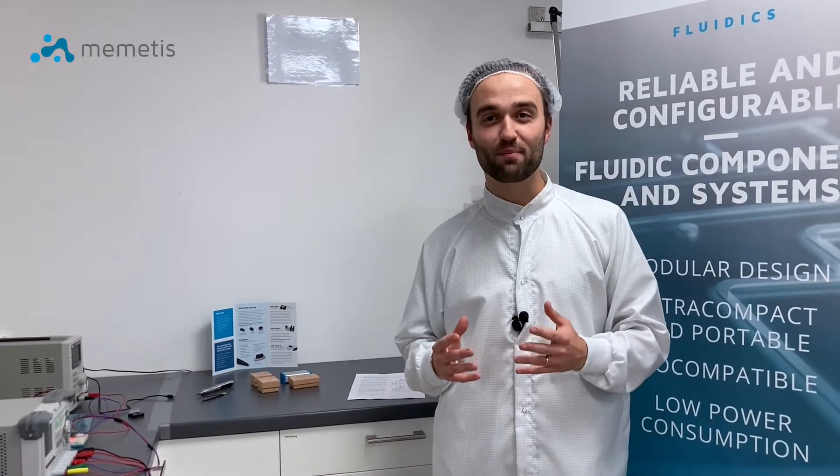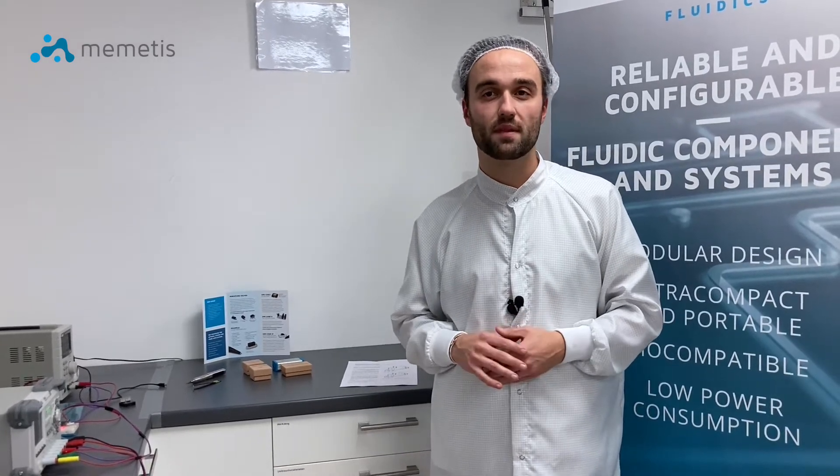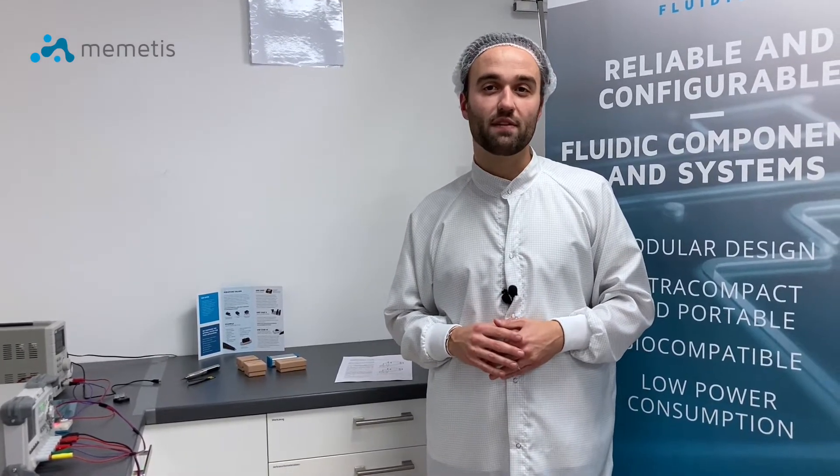Here at Memetis we develop miniature valves that enable smaller devices, for example in the areas of diagnostics or analytics for cell cultures and many others. In addition to saving weight and installation space, our valves are characterized by silent switching, a small internal volume and low power consumption.